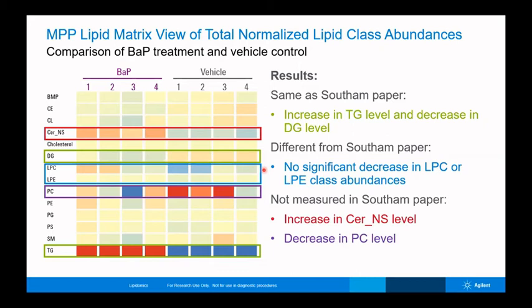What was interesting in this study is what came up in our results compared to the ceramides. In the paper, my colleagues found increased levels of ceramides, whereas decreased levels of phosphatidylcholines, and that wasn't reported in the publication. So the idea was to dig deeper and ask why we see different results. So I'll pick the ceramide example in this case.